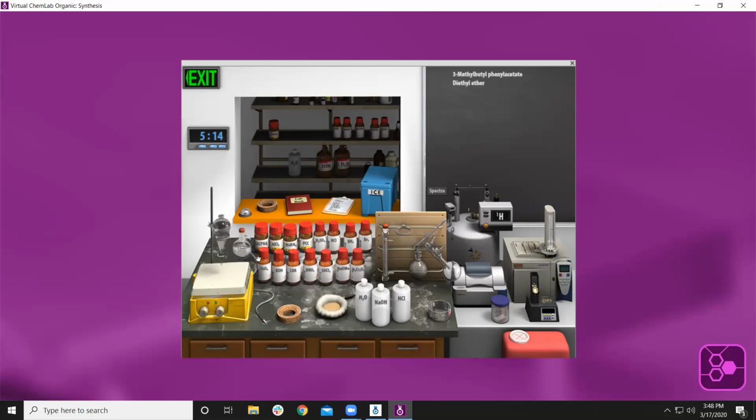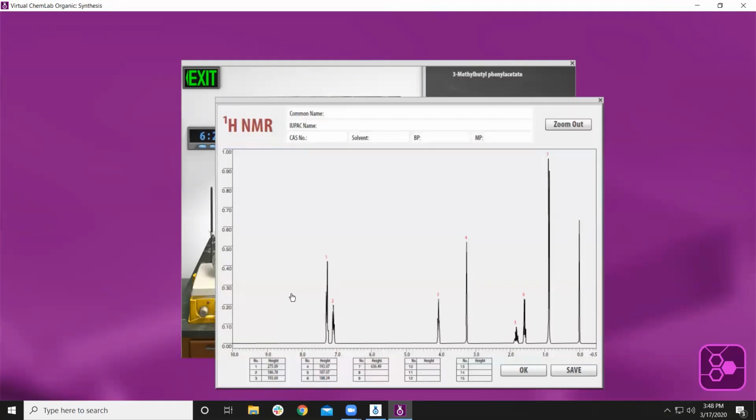And there's my organic. Now, by picking my organic layer, I'm going through a rotovap step. I could also, if I had something interesting in my aqueous layer, pull it off and have my two different layers separated in the flask. So now, how do I know it is what I want? So now you can do your spectroscopy. So here's proton NMR. And so there's your peak.